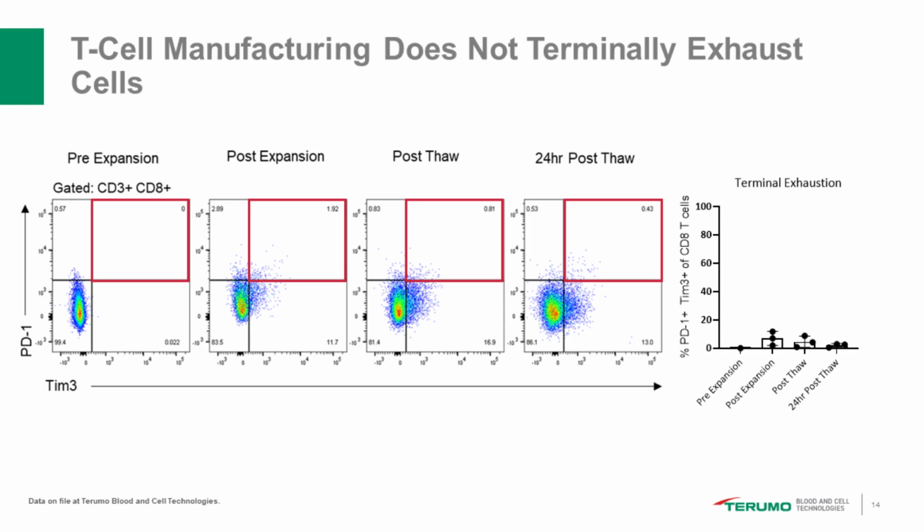As you can see in the columns on the right-hand side, there is a very slight increase in exhaustion markers, ranging between 1.7 and 11% for the different donors. But as they go into those cryopreservation steps we talked about, and you think about that in a clinically relevant setting, there is minimal representation of co-expression of those exhaustion markers.